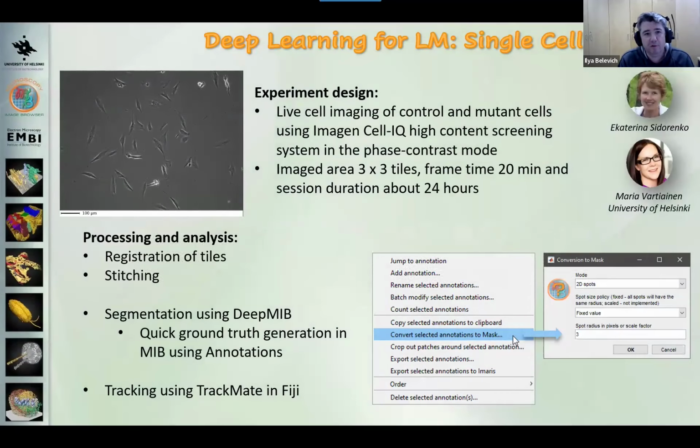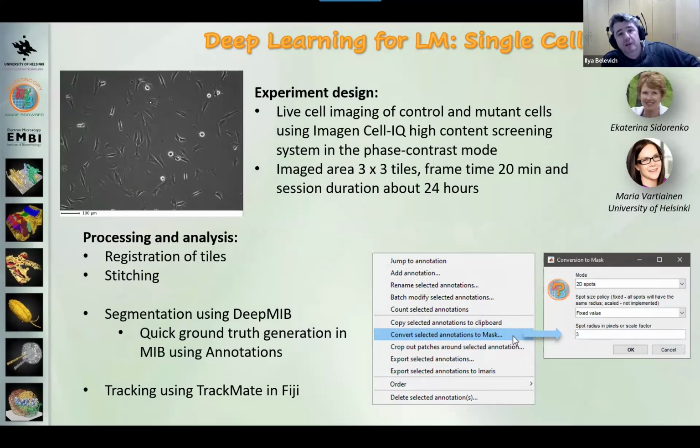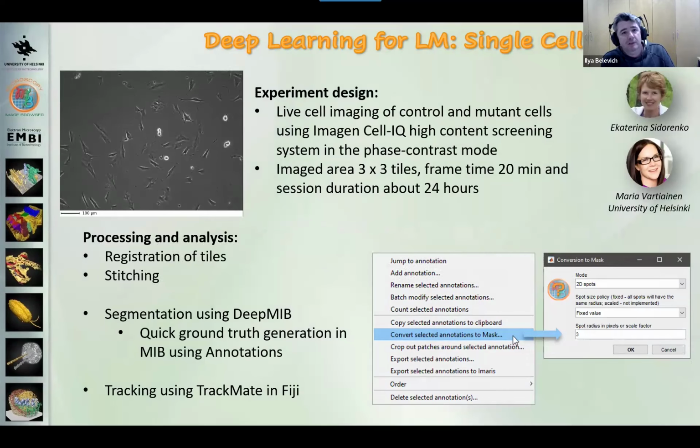So as I mentioned, we do a lot of this with volume EM, and our tools are really tailored for this. But in general, we also deal with a variety of data. And during these community days, there was a lot on tracking of objects. Here's my example on the same subject. These are cells that are just moving around, and our goal is to basically trace them.